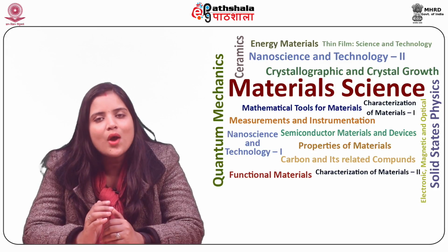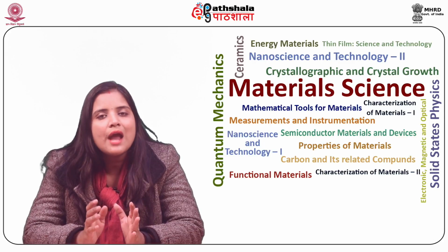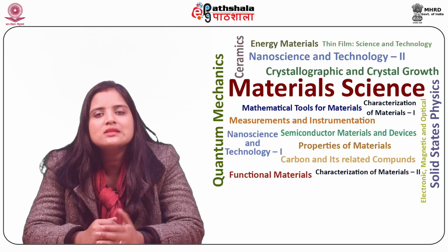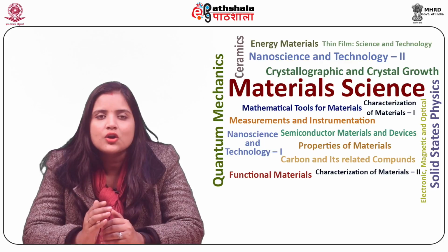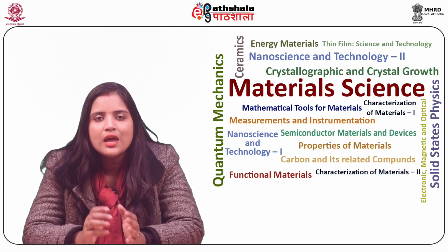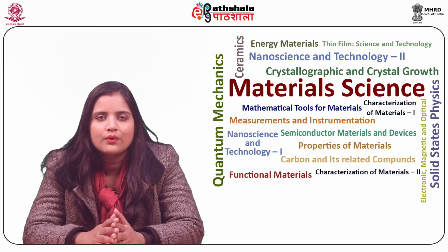EPMA is fundamental in chemical investigations of various solid substances at small spatial scales, that is, about 1 to 2 micrometers in diameter. Thus, this technique can also be used to study minute single phases such as minerals in any material such as rock with spot examinations.